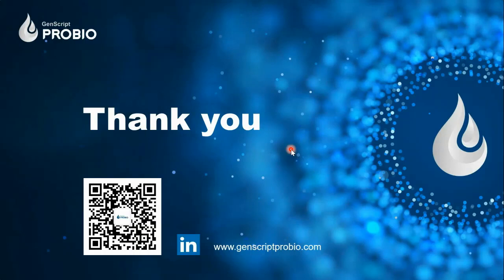Okay, thank you, Dr. Ali. Maybe we'll take the last question before we wrap up the whole session. Yeah, so the last question: you mentioned that the suspension process has higher host cell protein impurities compared with the adherent process. Is the downstream purification process more tedious?